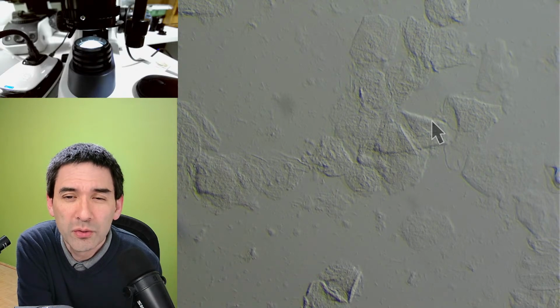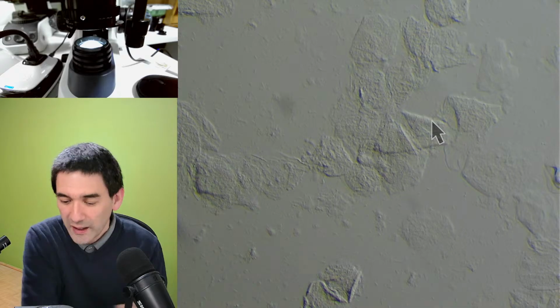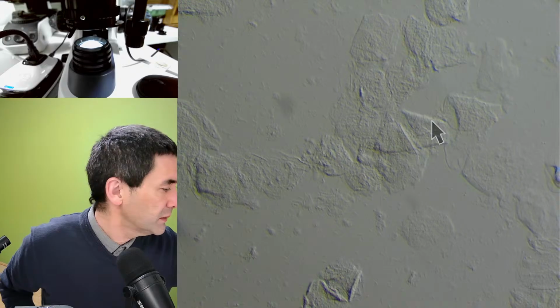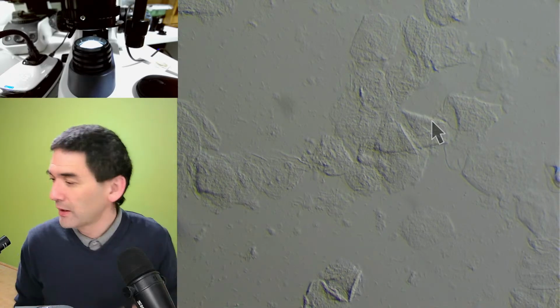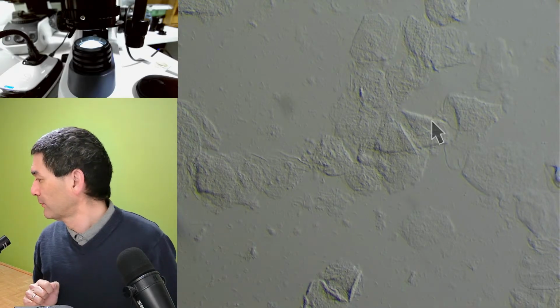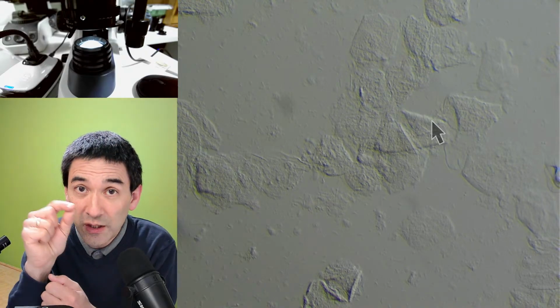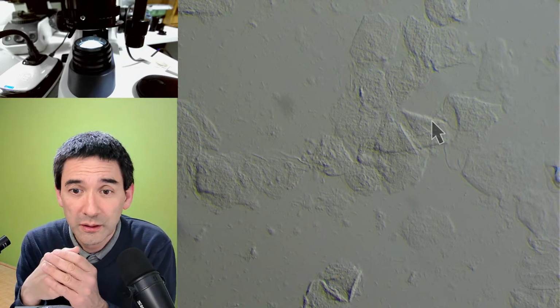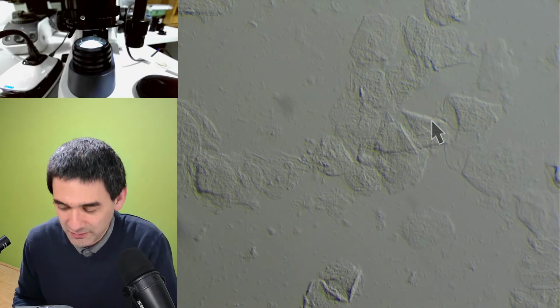I remember how you taught us to put a little piece of cardboard in the light or your hand. I played around with it for many hours. Yeah, just for your info, I've also done that. You take some kind of plastic piece, like from a plastic bottle, and cut it out, and then you glue some cardboard in the middle. You can make your own filter. So this is simply something that's possible as well.